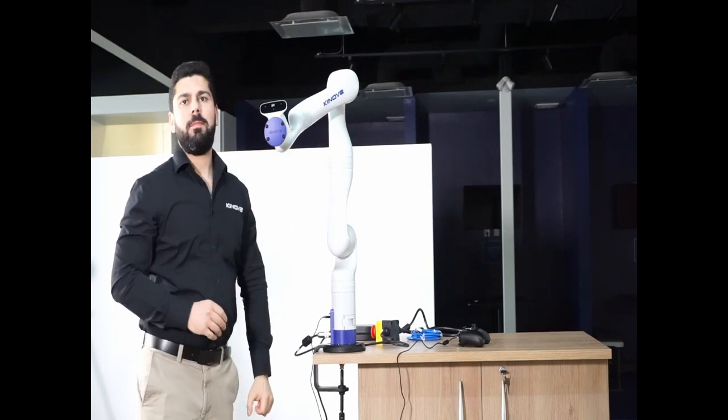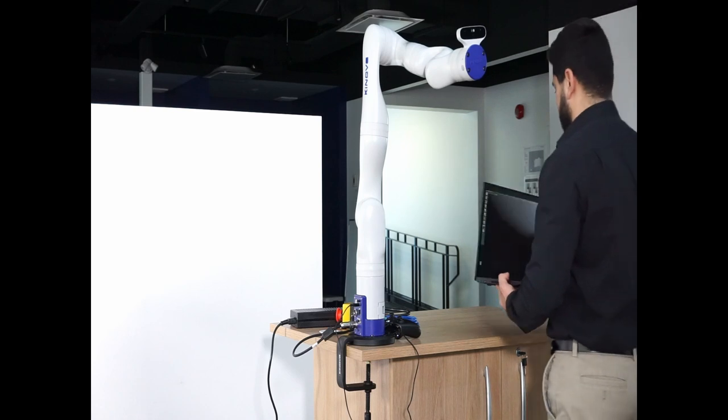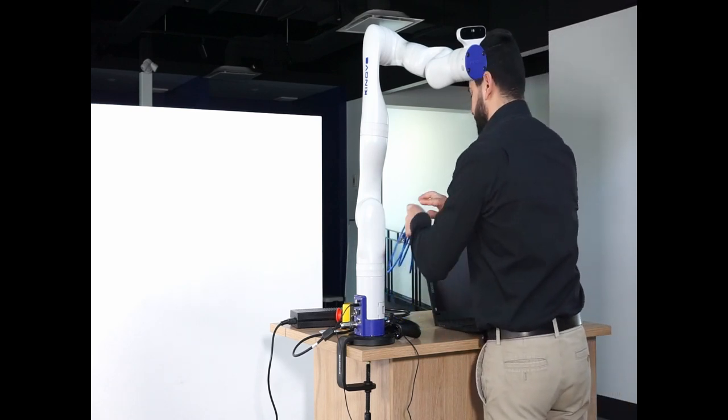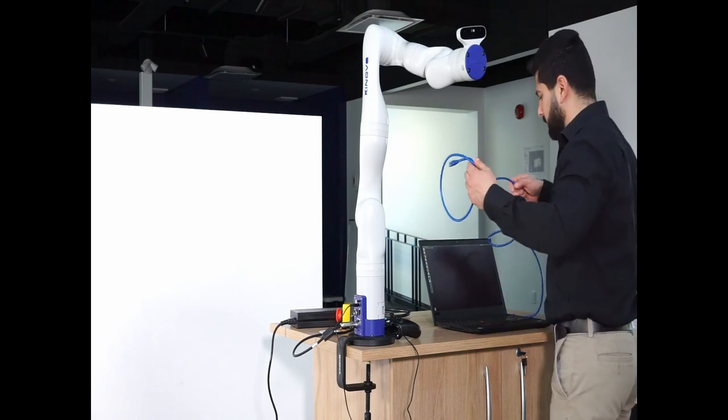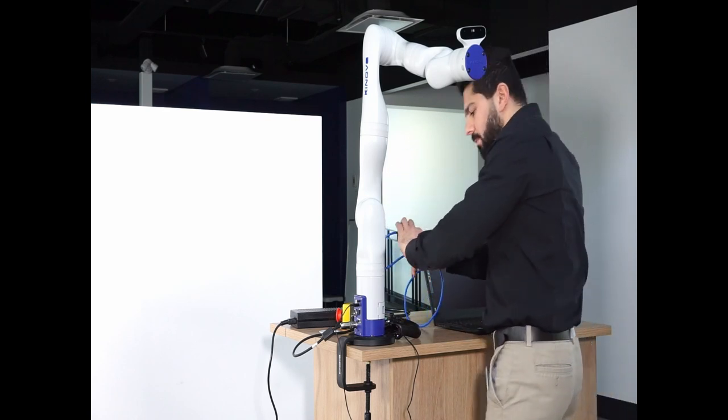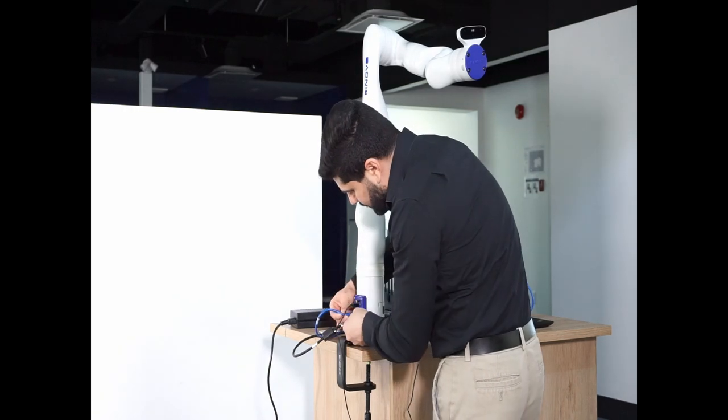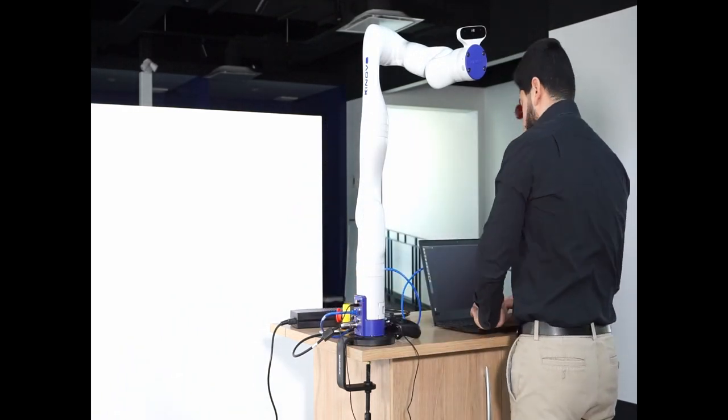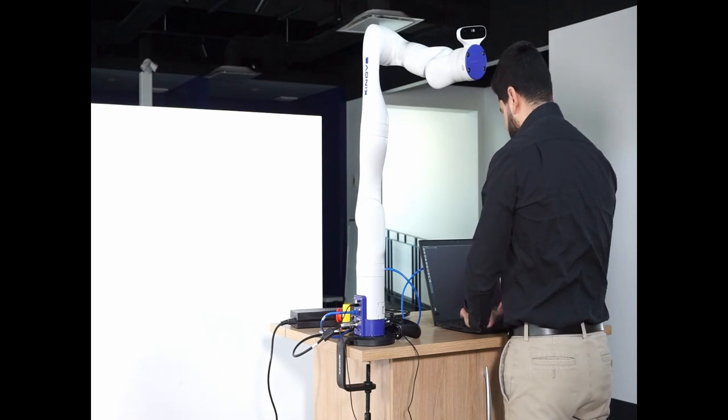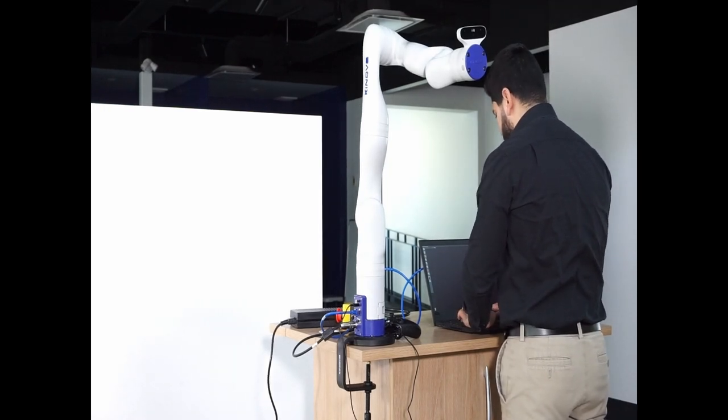Finally, you can control your robot using your computer through the web application or our API. To do this, you need to connect the Ethernet cable to your computer and to the Ethernet port of the base controller. The configuration of the communication between your computer and your robot will be presented in another video.